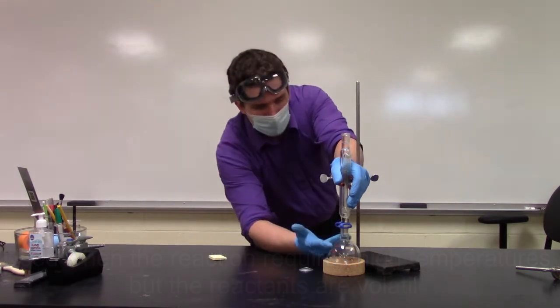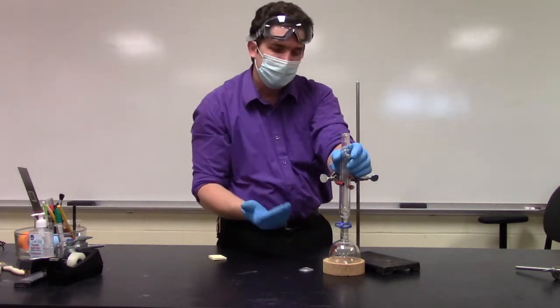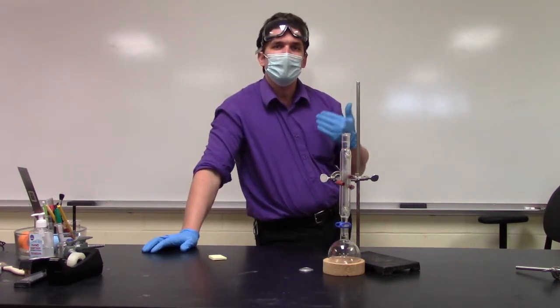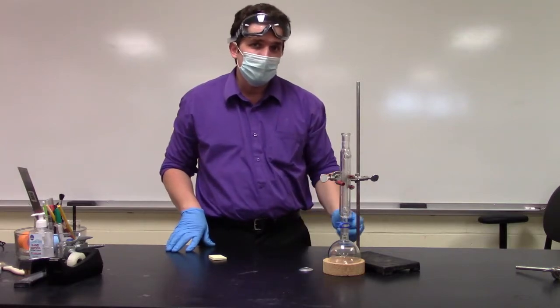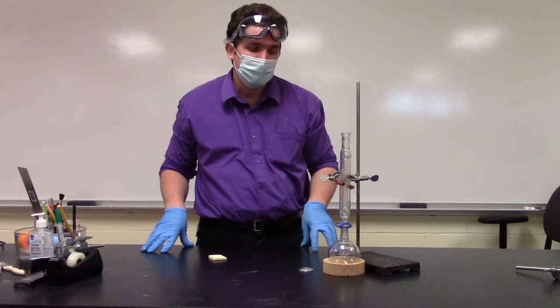Now, as these vapors begin to come off, the condenser column will begin to drop them back down. And what we would see during a typical reflux experiment is wetting of the column and the drops coming back down. Now, the idea of this is what we want to call infinite reflux. So basically, everything that gets evaporated comes right back down. Now, with refluxing, there is a specific definition that is associated with distillation. We're kind of using a limiting case here.